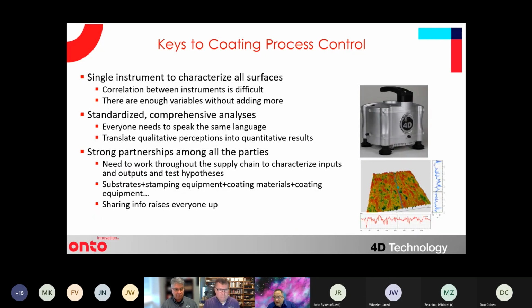Erik, I have a question kind of about how the instrument works. What is the minimum layer thickness that can be distinguished when you calculate SA for a multi-layer coating?